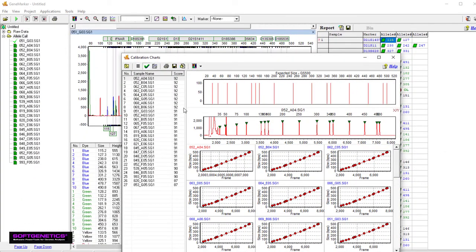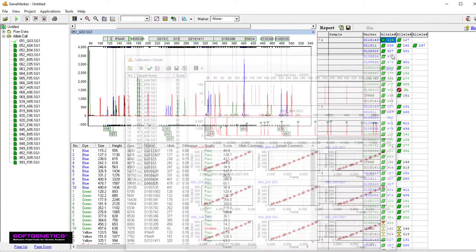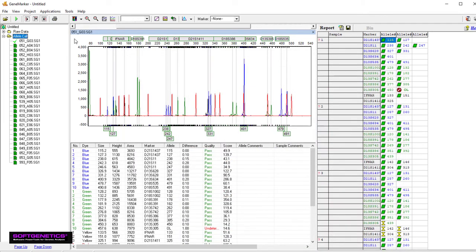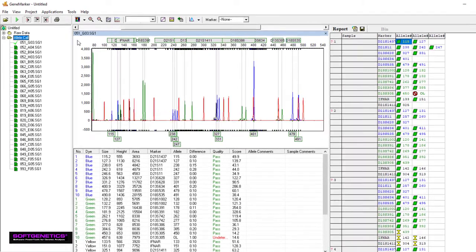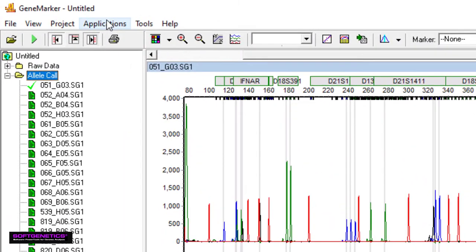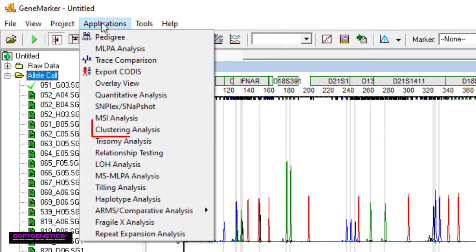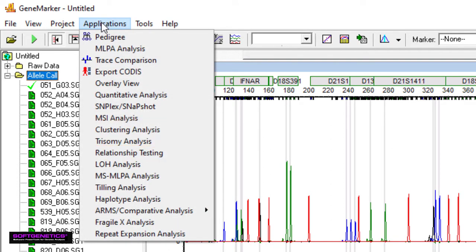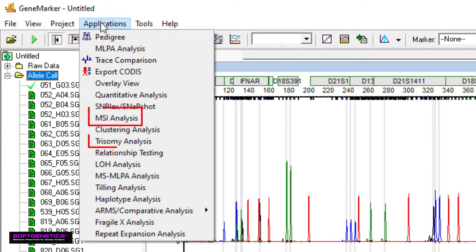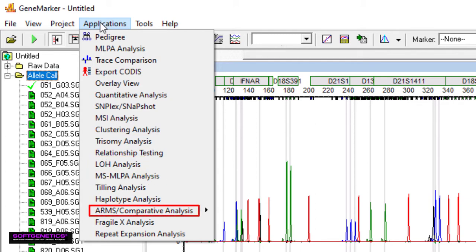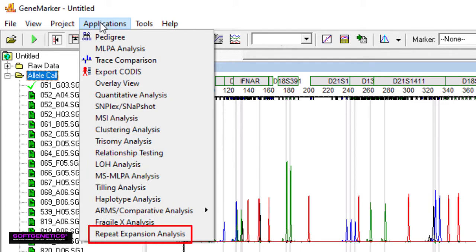Now that genotyping is complete, you can use one of GeneMarker's many postgenotyping applications, which are under Applications. There are postgenotyping applications for ecology research, such as clustering for dendograms and relationship testing. There are also clinical research applications for MLPA, MSI, Trisomy, LOH, MSMLPA, Cystic Fibrosis, Fragile X, and other repeat expansion diseases.